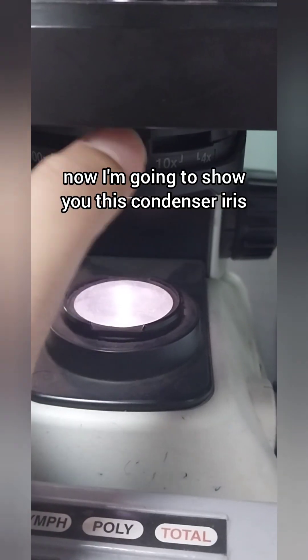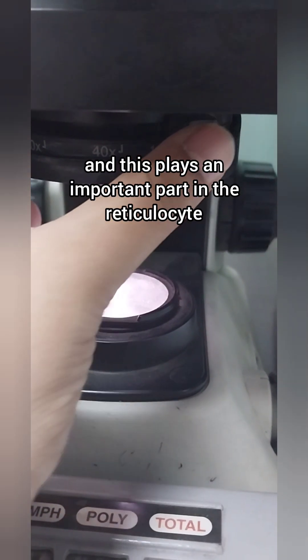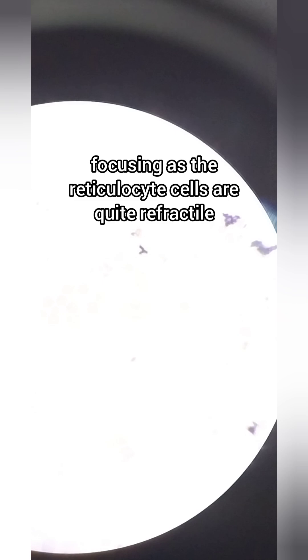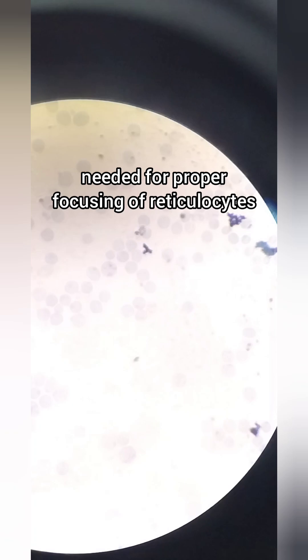I'm going to show you this condenser iris. This plays an important part in reticulocyte focusing, as the reticulocyte cells are quite refractile and the adjustment of light is sometimes needed for proper focusing of reticulocytes.